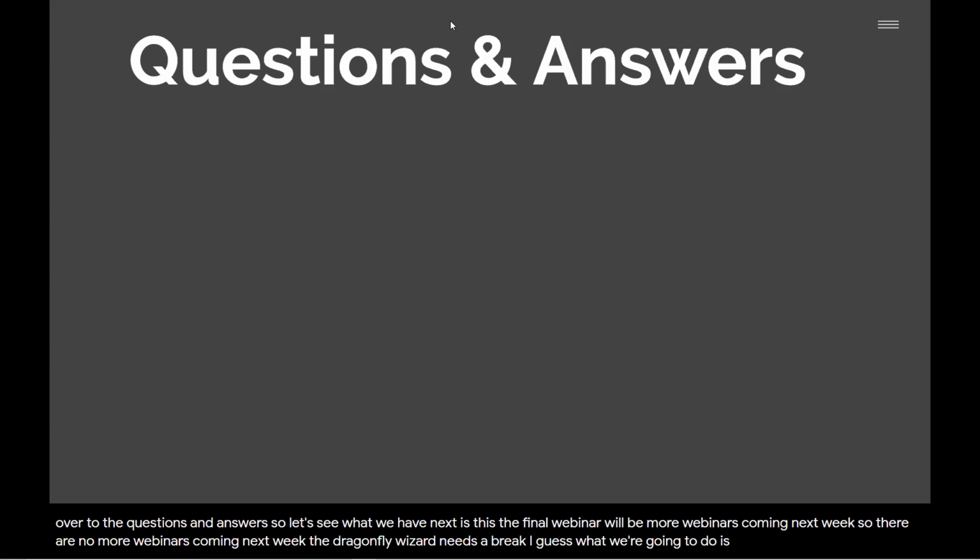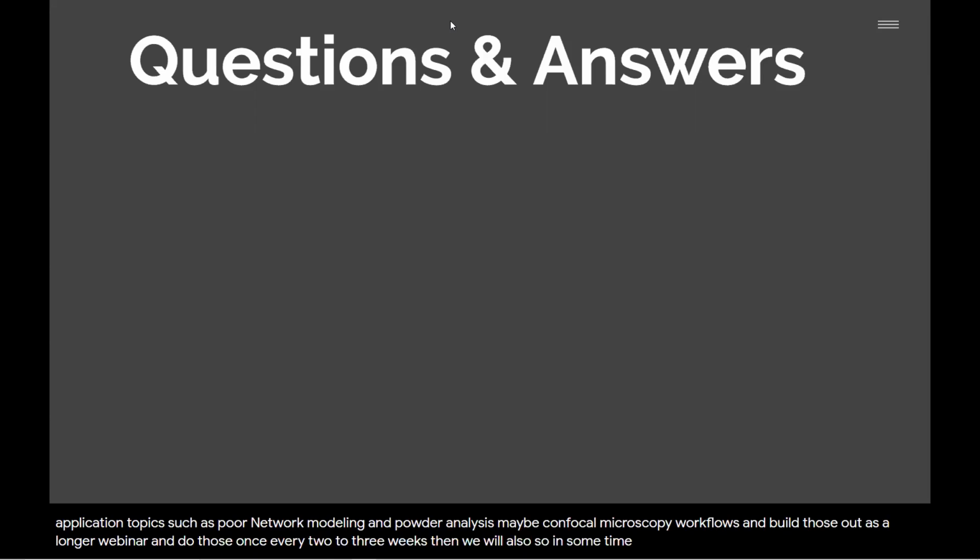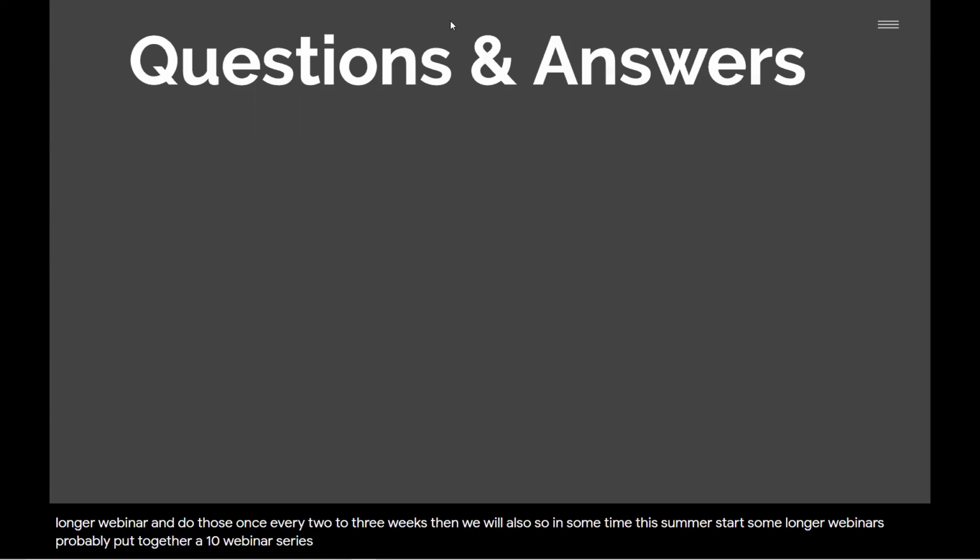What we're going to do is set up some webinars on application topics such as pore network modeling and powder analysis, maybe confocal microscopy workflows, and build those out as a longer webinar and do those once every 2 to 3 weeks. Then we will also, sometime this summer, start some longer webinars, probably put together a 10 webinar series on programming extensions for Dragonfly, because I think there's still a lot of demand on how to support that.